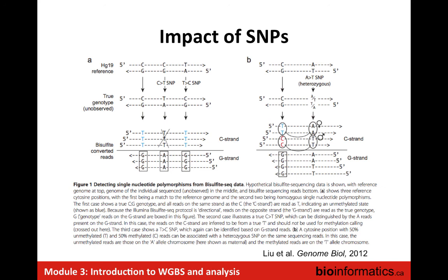So one more thing that I'll say on this is that typically the approach, unless that's what you're interested in, is actually to take the common SNP and map. Okay, well, thank you. Blind spot for me. The last thing I was going to say is that, unless you're interested in extracting this information, a safe thing to do is just to mask these regions that are common to have SNPs, to just get rid of that. Because again, if you don't have sufficient coverage, you won't necessarily be able to know.